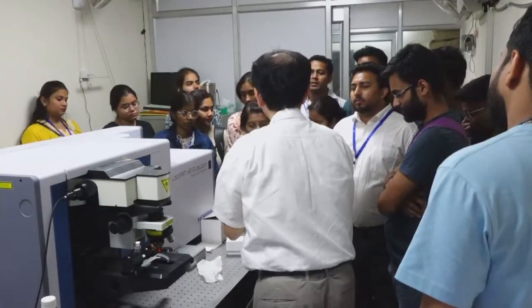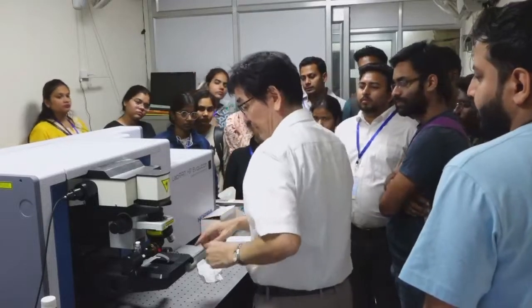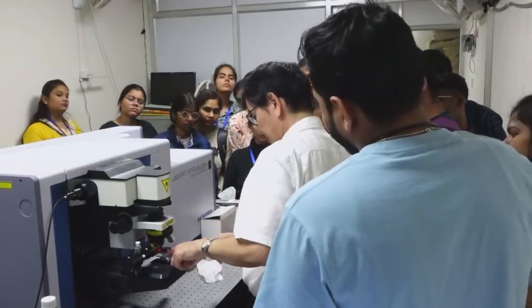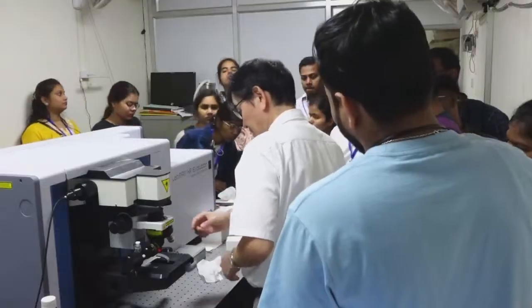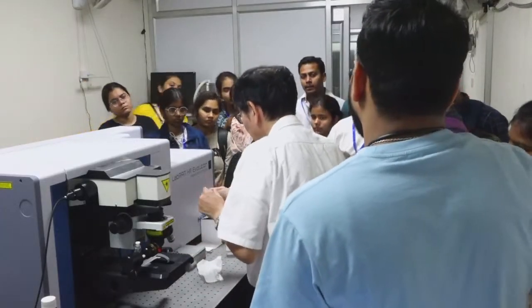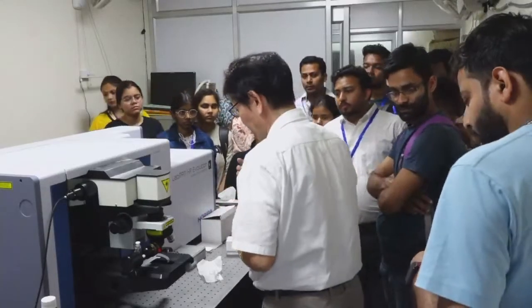From where is the sample loaded? The sample is typically placed here on the microscope stage, and the XYZ position of the sample is tuned finely. Then we find a good position.